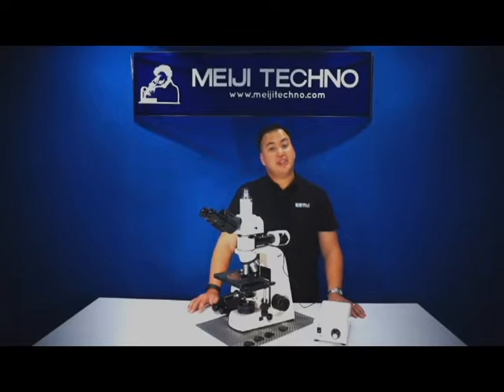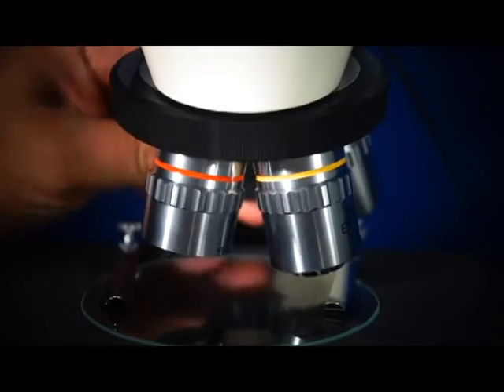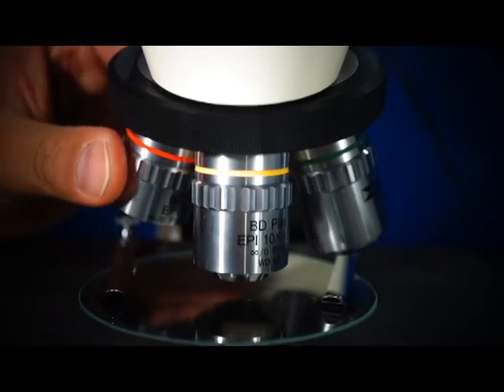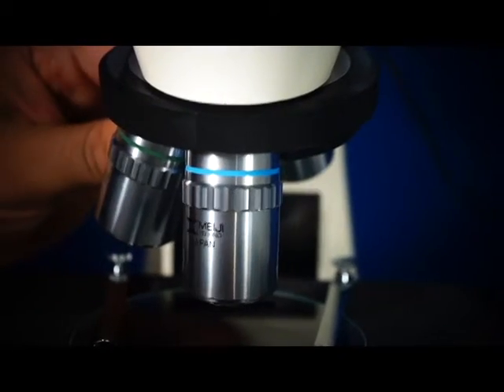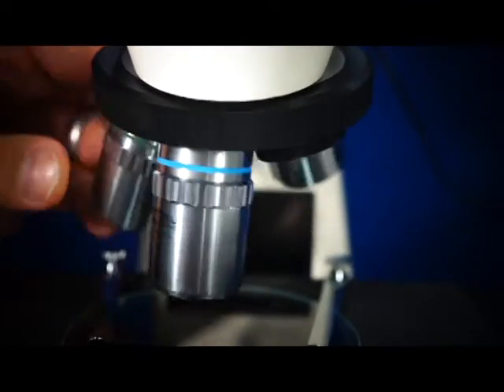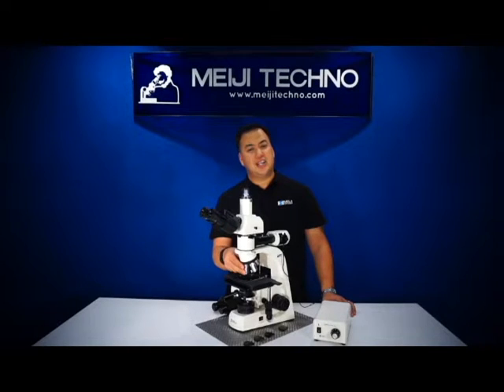The MT-8000 series is equipped with infinity corrected Plan Acromat Epi objectives. It comes with 5x, 10x, 20x, and 50x objectives. All objectives can be smoothly rotated on the ball-bearing quadruple nosepiece, as you can see here.